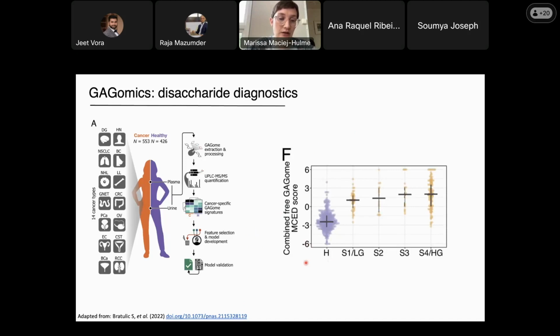So here is the healthy cohort, and these are all the cancer types put together, and then they staged them between early stage, stage 2, stage 3, stage 4, and high grade. And you can see here that quite clearly there's a difference between the healthy controls and early stage or stage 1 of a cancer type. However, although any cancer detection is clear, which one cannot be deduced from disaccharide GAGomics? Otherwise, they would have shown this in the data. And this actually highlights one of the main problems with disaccharide analysis: oversimplification.